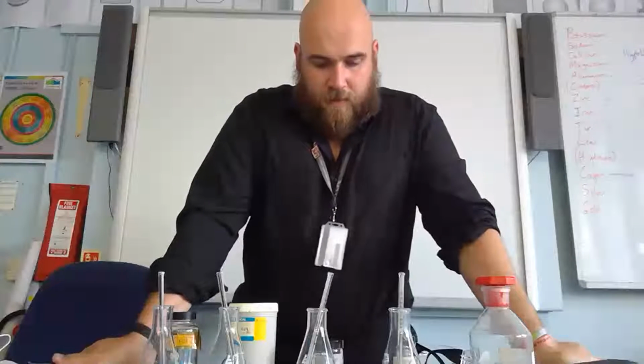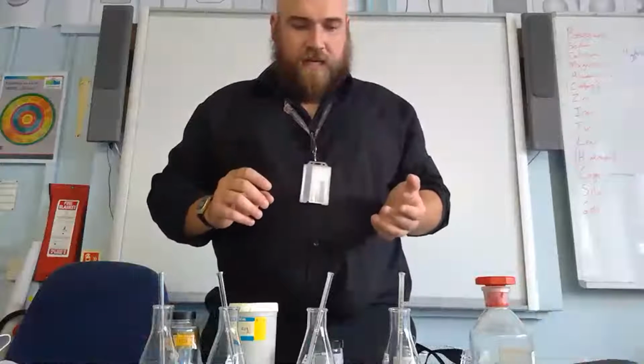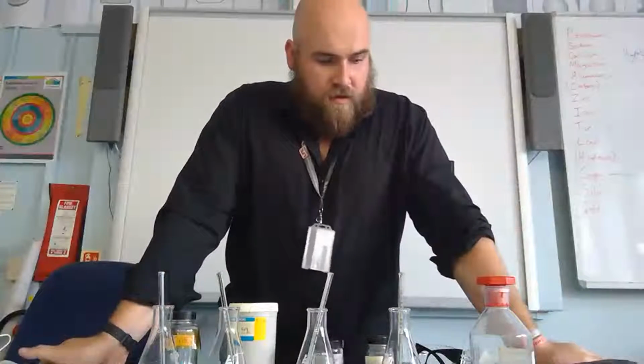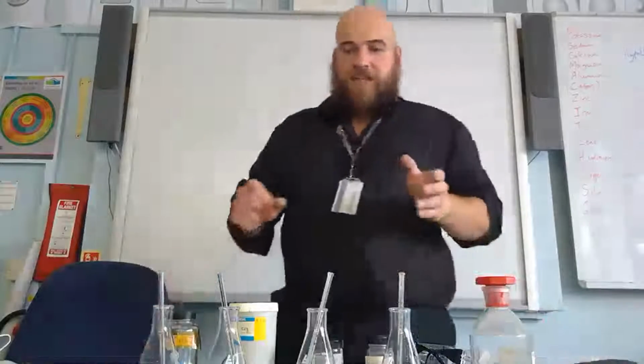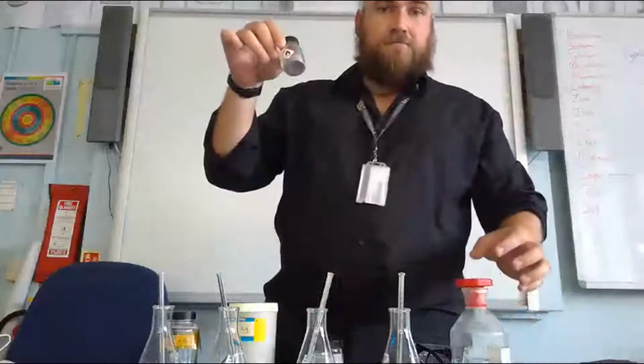And Lacey. Right. So hopefully, if we're keeping the volume of the solution the same, what do we need to keep the same about these metal powders? Hopefully, you've got the idea of it's going to have to be mass, right? So solids, we always talk about mass of solid, not volume, not amount. We never, ever use the word amount. Amount is just too vague. So if you're dealing with liquids, go with volumes. Solids, masses. Yep. So you should keep the mass the same.